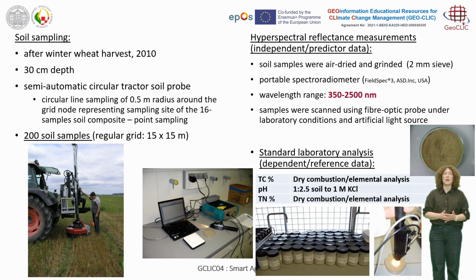At the same time, standard laboratory analyses were done because we need dependent or reference data from the wet chemistry to build the calibration model. Total carbon content was determined using elemental analysis and the dry combustion method.